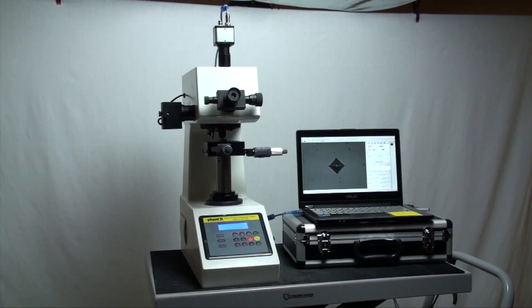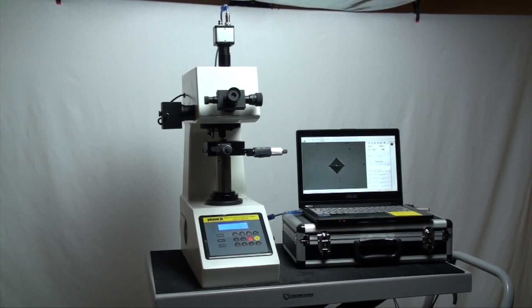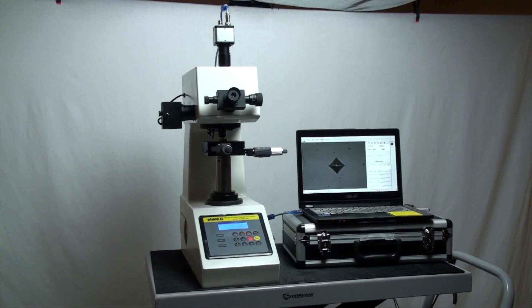This is an instructional video detailing the applications and functions of the Phase II Digital Micro Vickers Hardness Tester with Manual Turret.